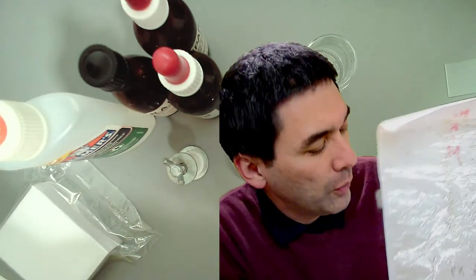And how was this collected? The former student who gave it to me, they are commercial honey producers. And everyone who is keeping bees also has to make a control. They have to check how many mites are there. I'm going to quickly show you two short videos, so that you get a little bit of context here.